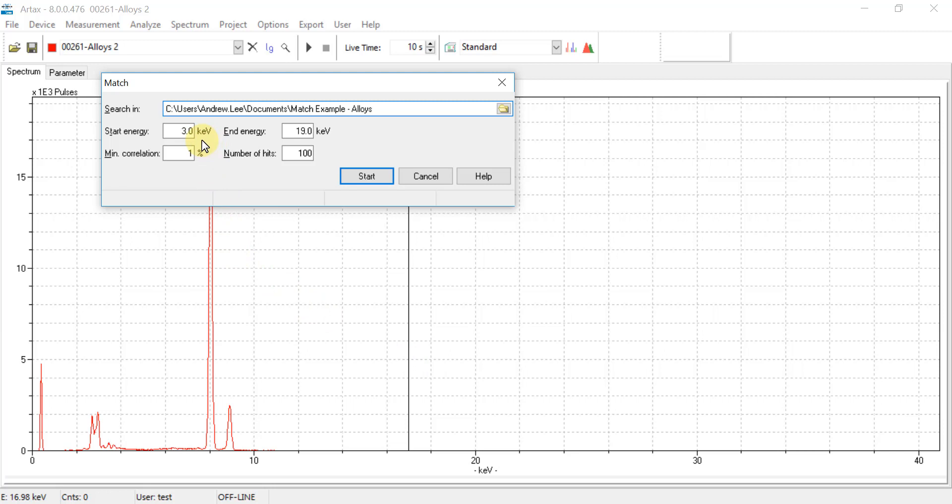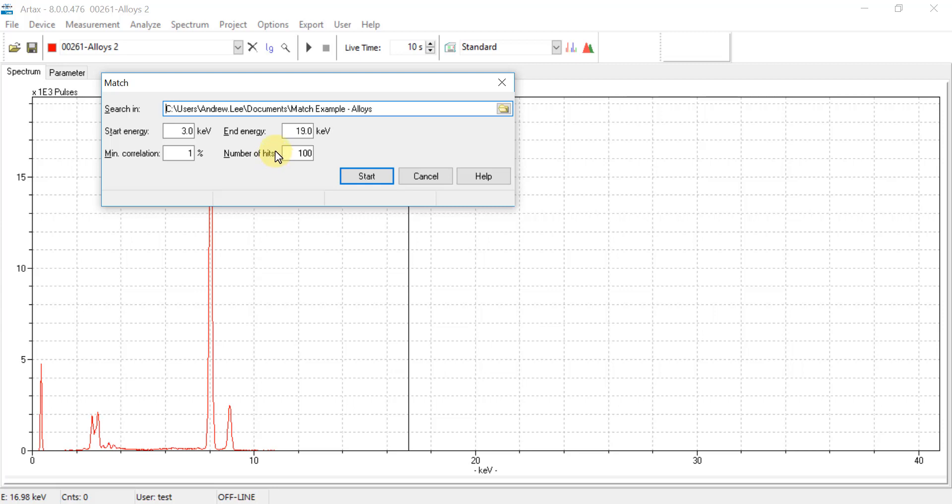Then navigate to the appropriate folder. When found, then hit Select Folder. Other parameters are the start and ending energy, which is the active energy range used to compare the spectra. Generally 4 to 19 keV is sufficient, but this can be adjusted to include lighter or heavier elements. The user can also set the minimum correlation value required to validate a match, and then the number of hits will define the number of matches reported. When finished, click Start.